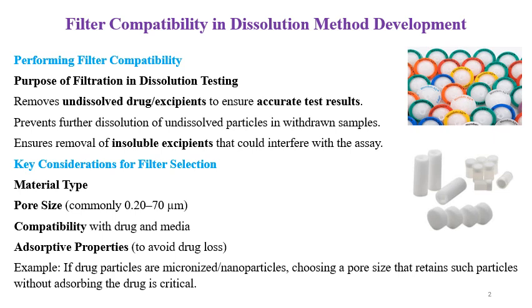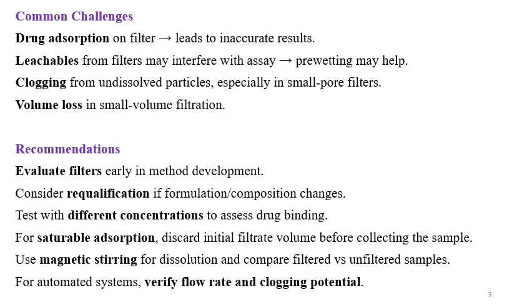Common challenges in the filter selection, filter compatibility studies are drug adsorption, leachables, clogging, and volume loss. Drug adsorption on the filter leads to inaccurate results. Leachables from the filters may interfere with the assay, so pre-wetting of the filters can help you to avoid this issue. Clogging from the undissolved particles, especially in small pore filters. Volume loss in small volume filtration. These are the common challenges.